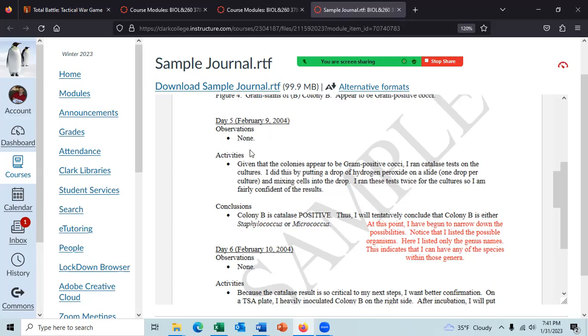The observation would be in the catalase test, I saw that there were bubbles forming when I added hydrogen peroxide to my cells. And the conclusion from that test is that this colony is catalase positive, meaning positive for catalase. Okay.